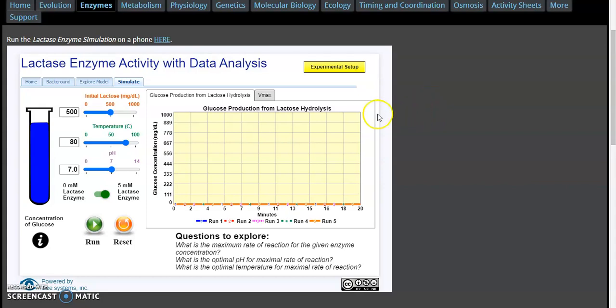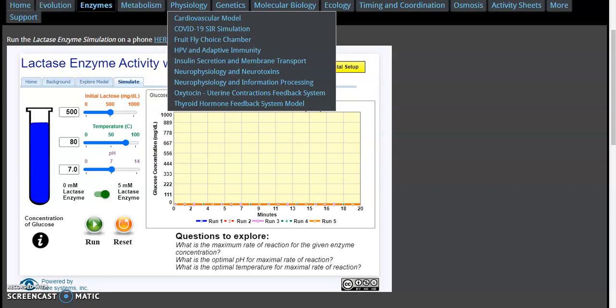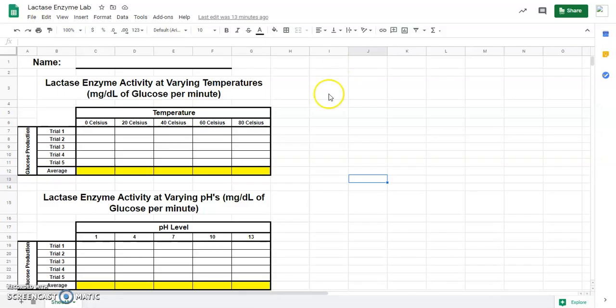This is part 2 of the video. So if you haven't watched part 1, then you have to watch part 1 first, but this is part 2. Okay, so where we left off at the end of part 1 was we had just completed the table at the top here for temperature.